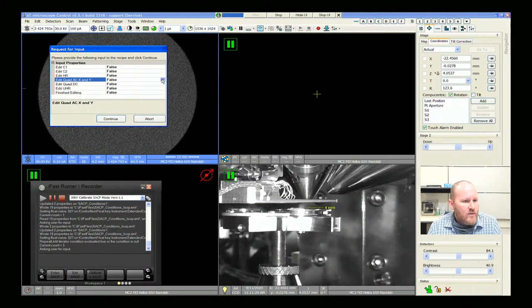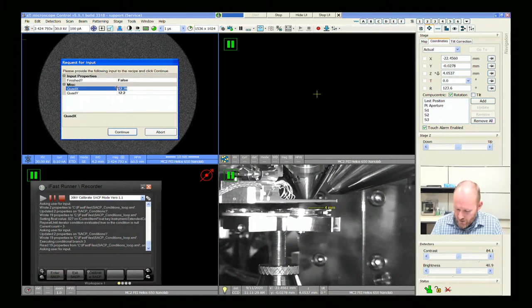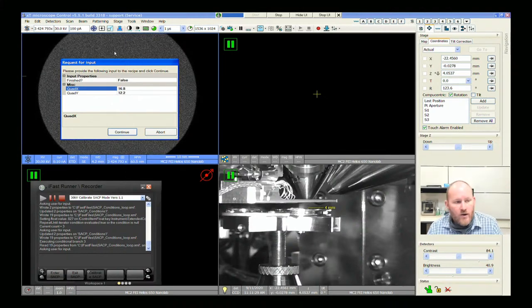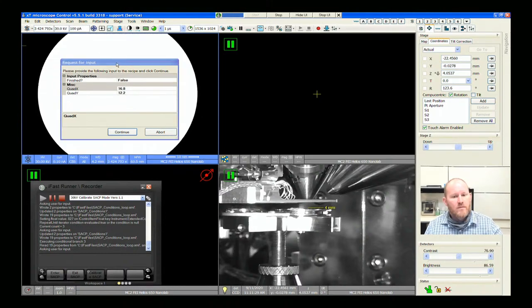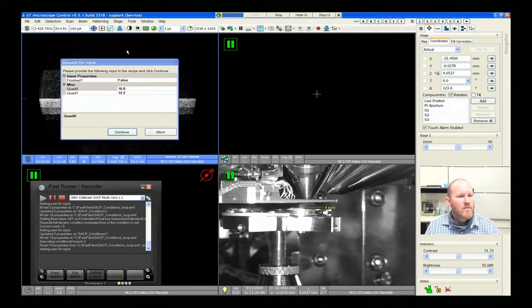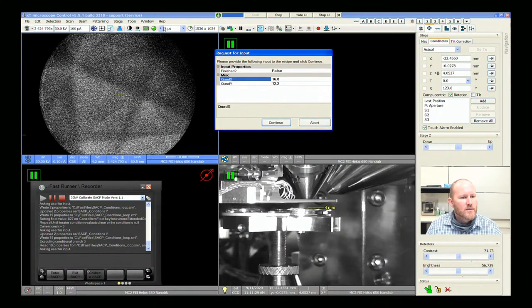The AC X and Y we had modified a little bit, so let's change those values. X we like 16.8. Go back to the CBS detector. Turn this brightness way down. I'm going to move this off a little bit — so there we see the pattern. Unfortunately, being a multi-user facility, I think our backscatter is a little off center, so we've got a little bit of a dark edge.